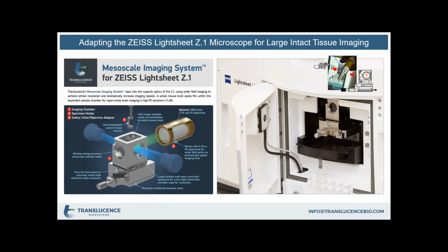So when we founded the company just over 3 years ago, we had access to a light sheet Z1 microscope at UC Irvine, where our company was founded by myself and a professor from UC Irvine, Sunil Gandhi, and his MD PhD student, Ricardo Azevedo, who actually helped develop the iDisco Plus method and ClearMap software for quantification when he was in Marc Tessier-Levine's lab.